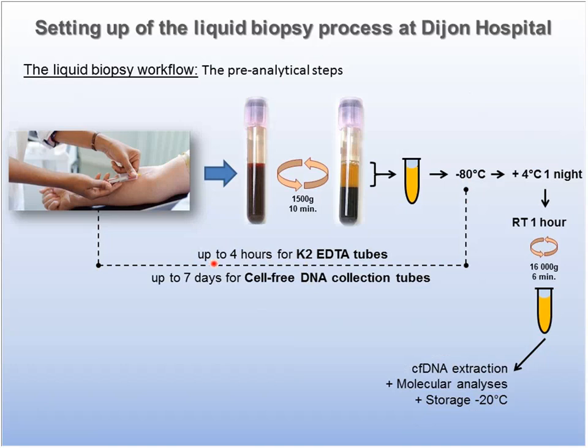And for cell-free DNA collection tubes, we have to limit it to 7 days, but also for these tubes, it's about 5 days. So we perform 2 centrifugations.